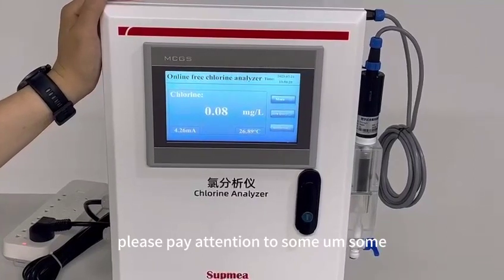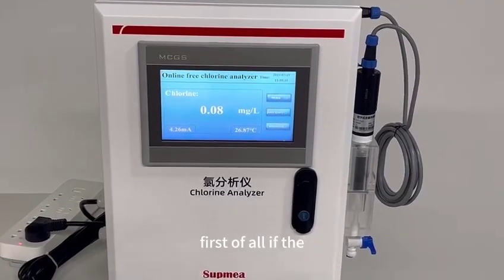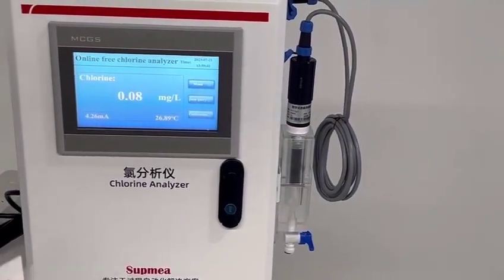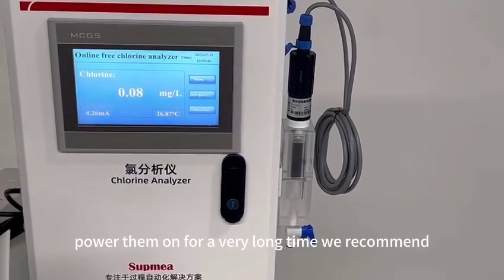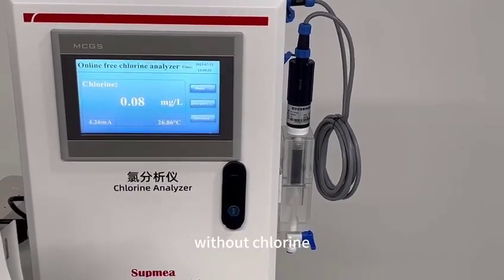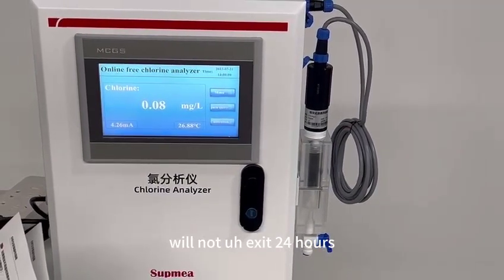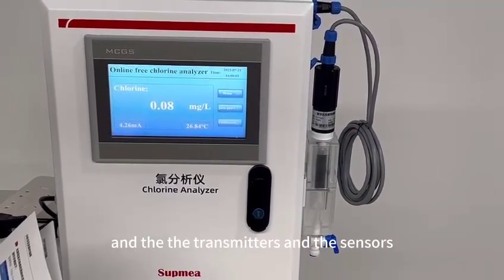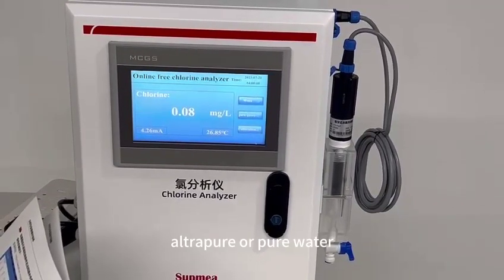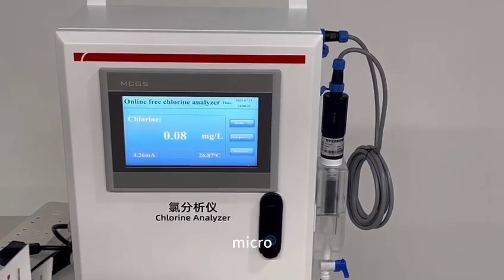Please pay attention to some common mistakes. First, if the flow chamber does not have any water, do not power it on for a very long time. We recommend that if you use the sensors in water without chlorine, the time should not exceed 24 hours. Also, the transmitters and sensors — especially the sensors — cannot work in ultra-pure or pure water, meaning water with conductivity less than 100 microsiemens per centimeter.